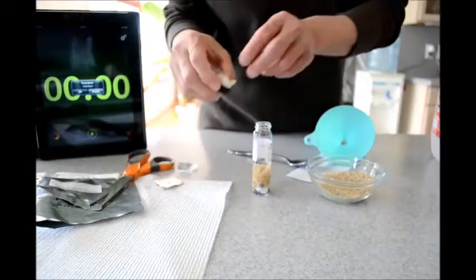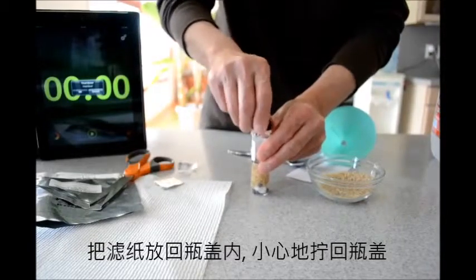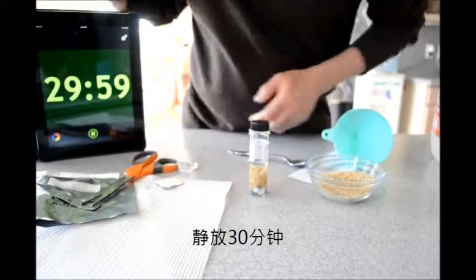Replace the filter paper into the cap and screw this in. Now let's set the timer for 30 minutes and we'll wait.